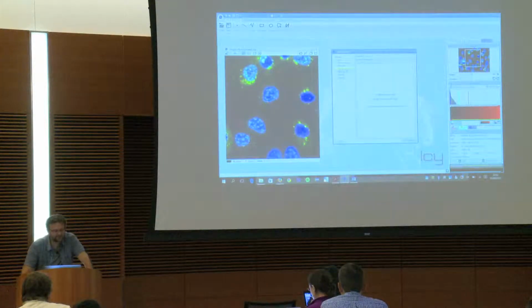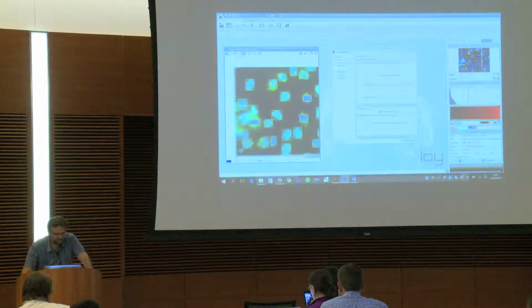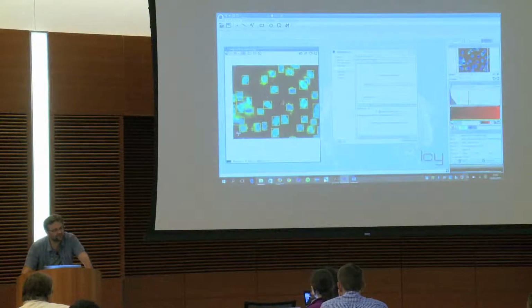And then you can put the region of interest. So in our case, what we're going to do is create it from a channel. That is going to be the blue channel. And I can test it, and you see that I have my ROIs that are created here.